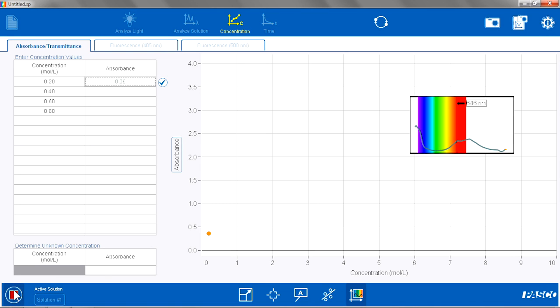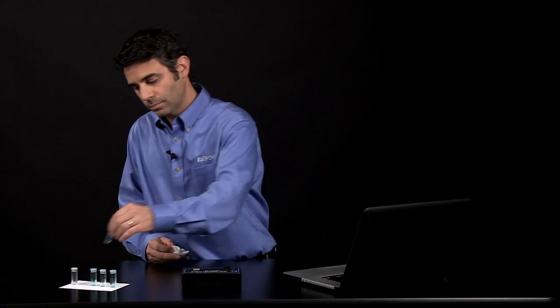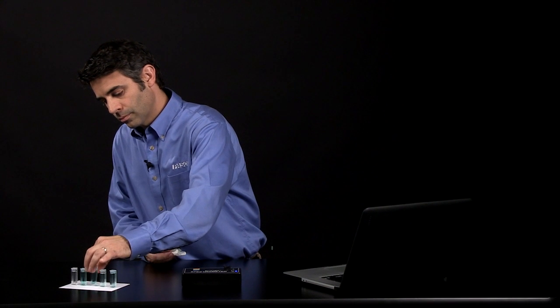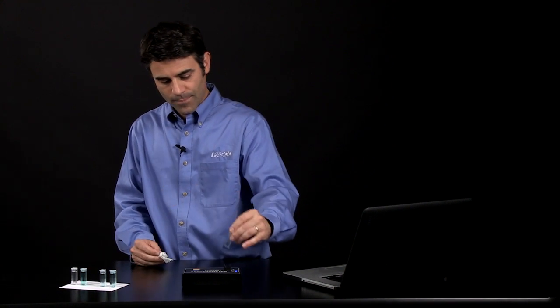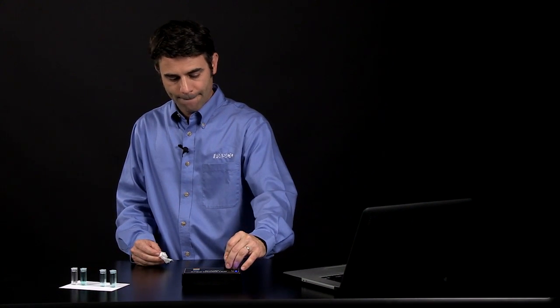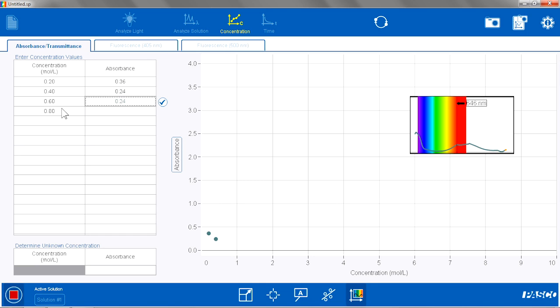To get started, I am just going to hit Start. In this case, it actually is 0.2 for the concentration. I am going to hit Check to save that absorbance. I am going to put in my next standard, wait for that to stabilize, and hit Check. I am going to change the concentration value to 0.14.